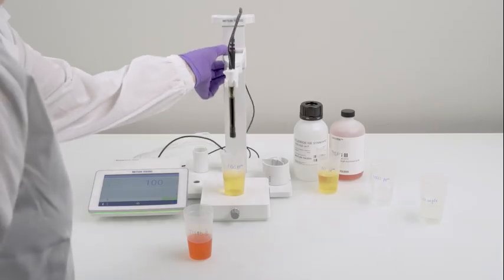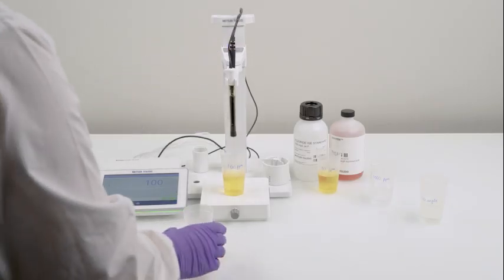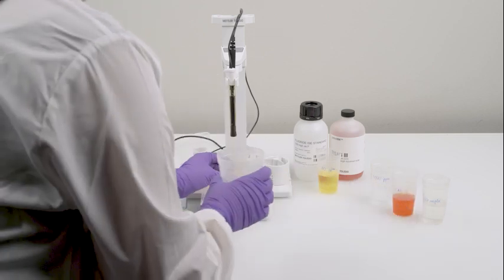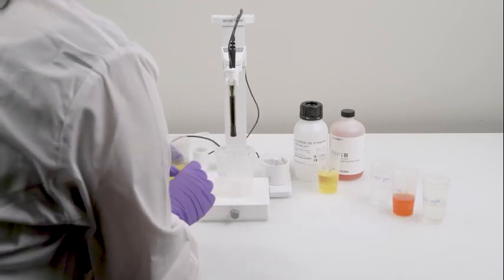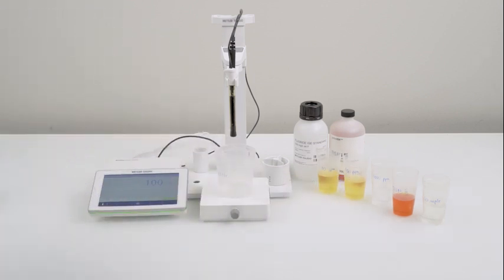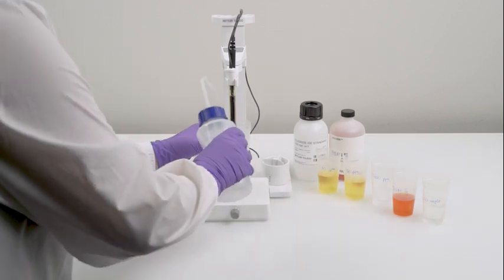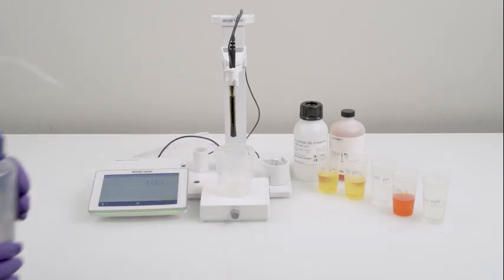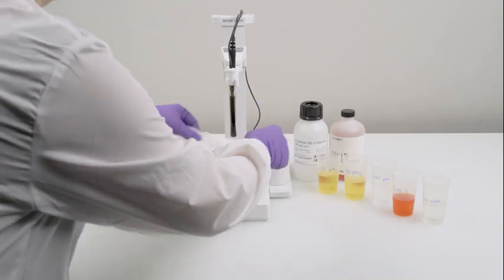After calibration, wash the sensor using distilled water and gently blot it dry with tissue paper.